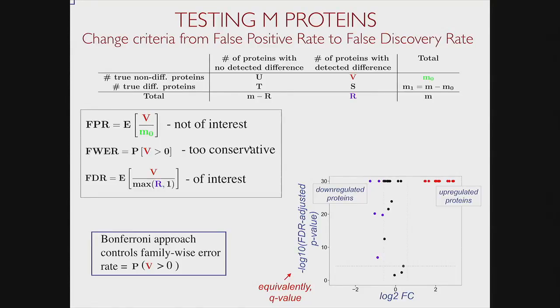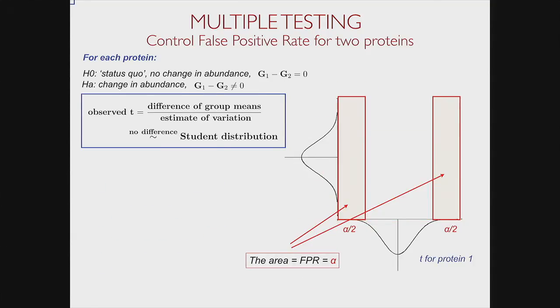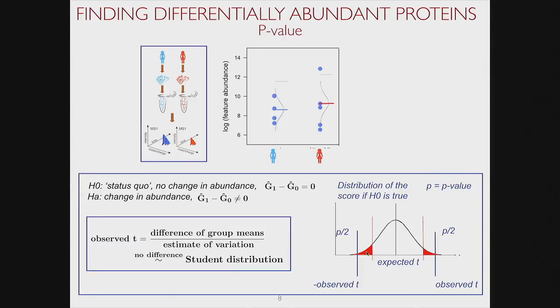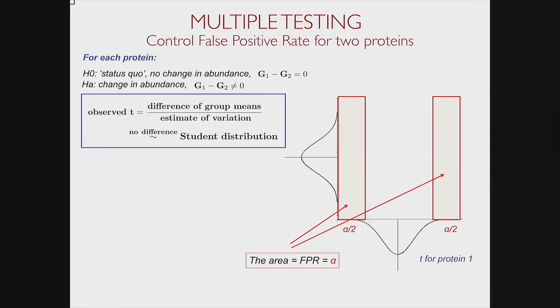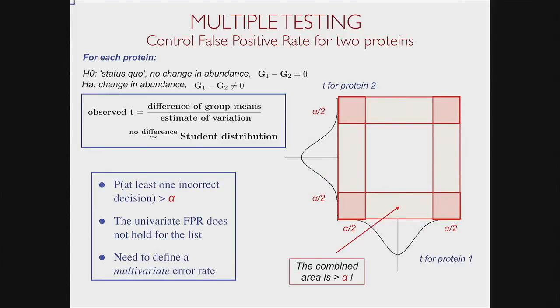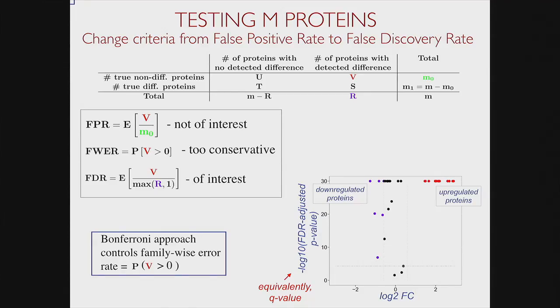And so, going back to my previous examples with p-values, you can either change your decision, or you can adjust the p-values. You can manipulate the p-values such that the p-value cutoff now considers the entire list and controls the false discovery rate. And in fact, this is exactly what MSstats is doing. So when you do the exercises, MSstats accounts for that by adjusting p-values. And to go back to this question, this is exactly what the outcome would be.